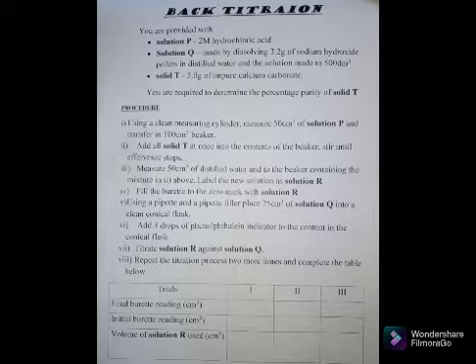Then we use that solution R to fill the burette up to the mark. After doing that, we pipette 25 cubic centimeters of solution Q into another conical flask. And then we add 3 drops of phenolphthalein indicator into the solution Q inside the conical flask. After doing that, we titrate. Remember now the burette has solution R. Then we have solution Q in a conical flask. We titrate the two solutions. Then, of course, we repeat the procedure two more times to fill in the table below.